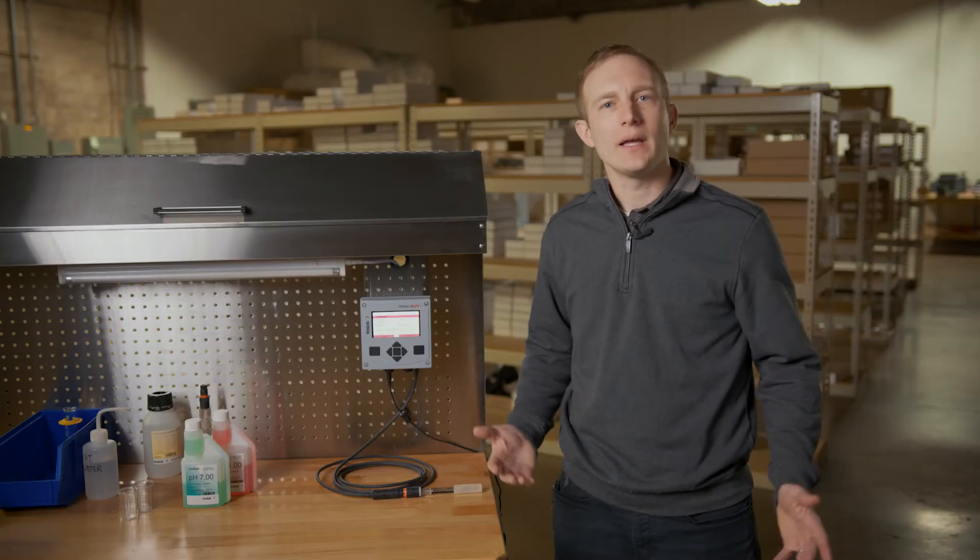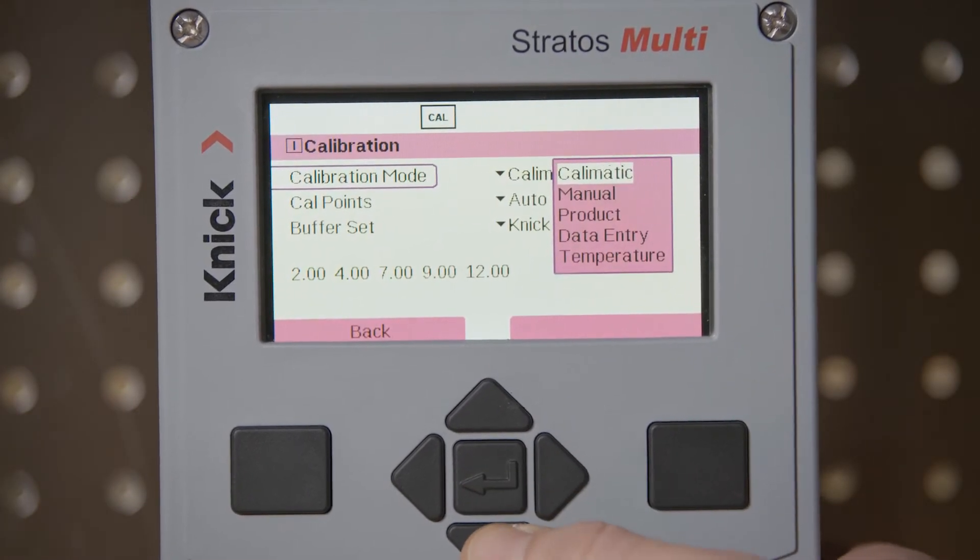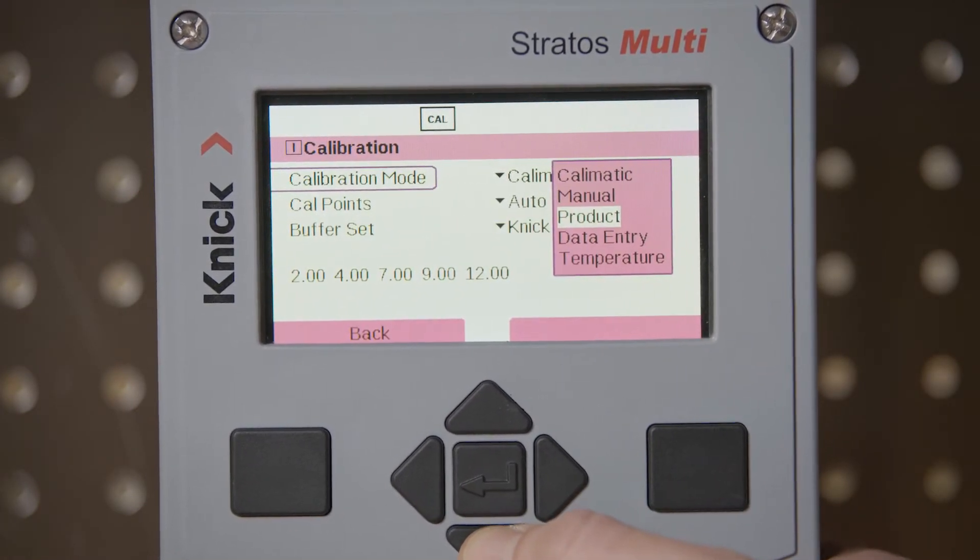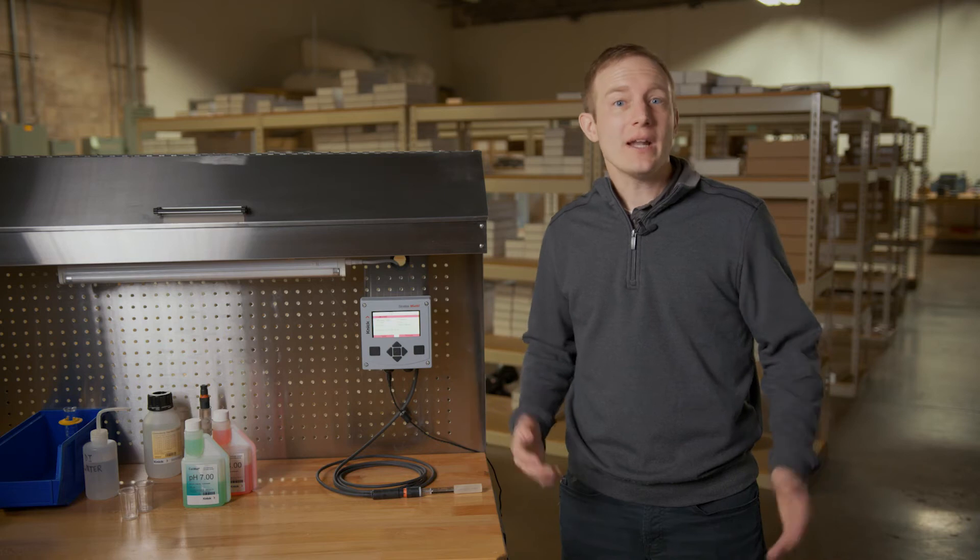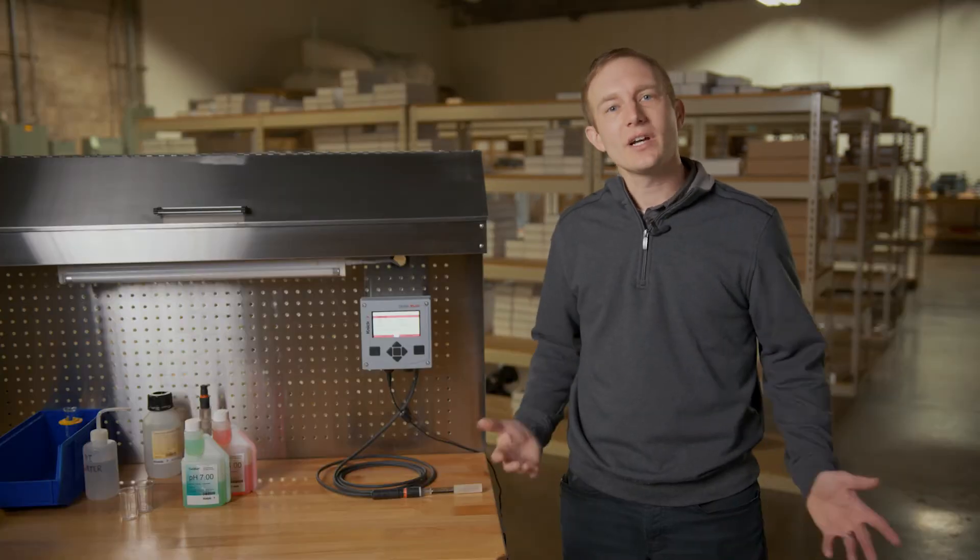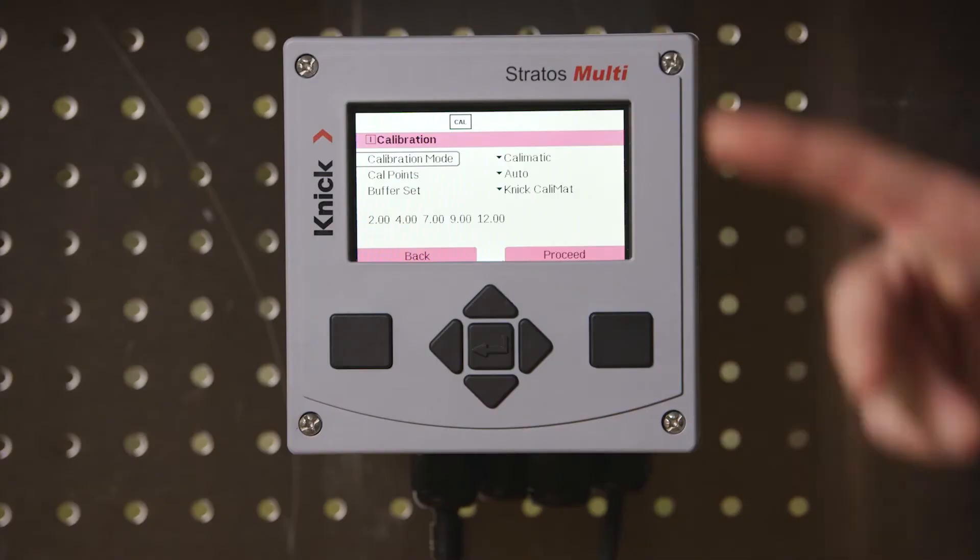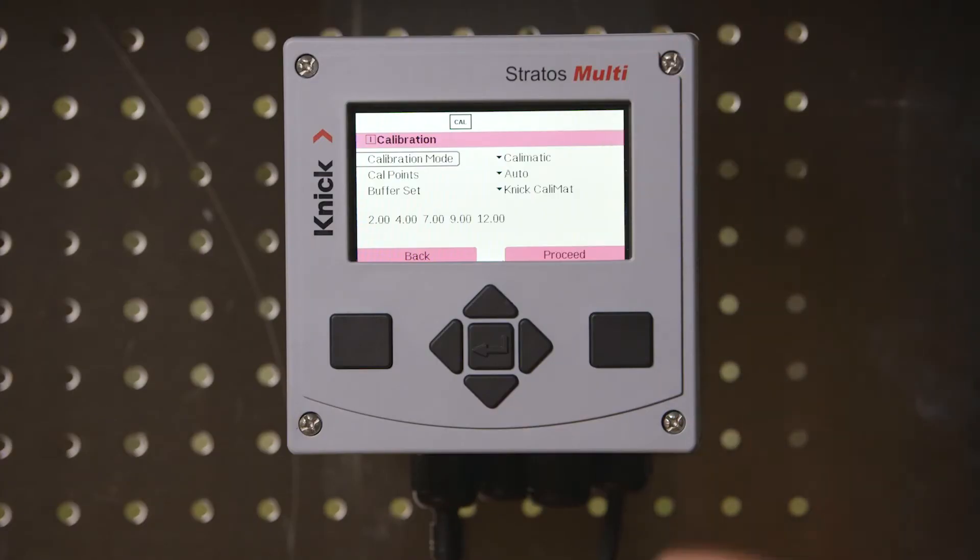We will be conducting a Calimatic or automatic calibration today but here you can see the different options available when performing a calibration. The Stratus Multi also allows us to perform a manual calibration, a product calibration or single point standardization, adjustment of the electrode slope and zero point via data entry, and lastly an adjustment of the internal temperature detector. We will ensure that Calimatic is selected here before proceeding further.